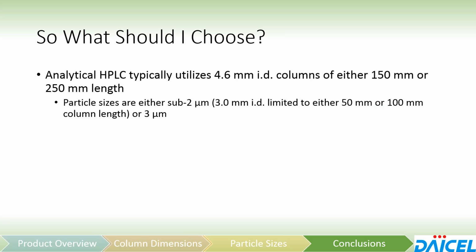Not that big of a deal, but something to be aware of. We can custom pack longer length columns if you so choose, but that's what is more or less commercially available at the moment. Now, again, like I said, this can change. This really depends on your separations.